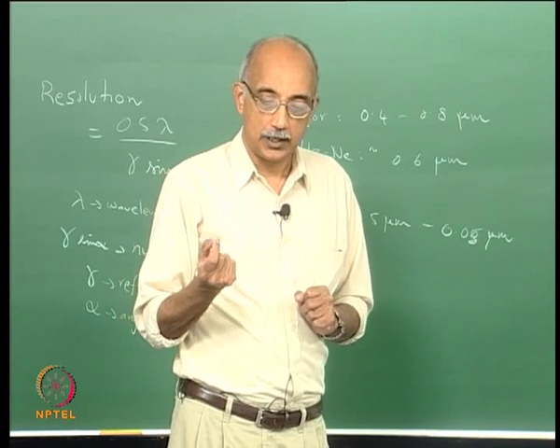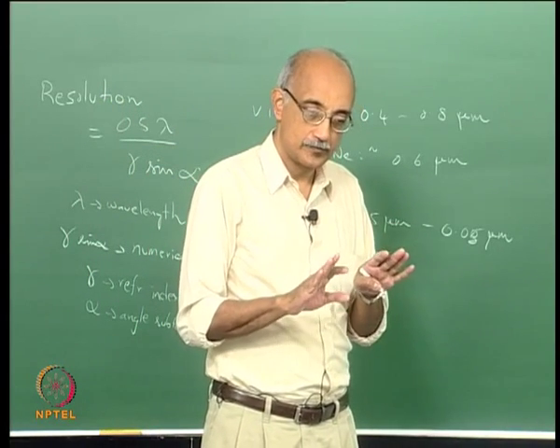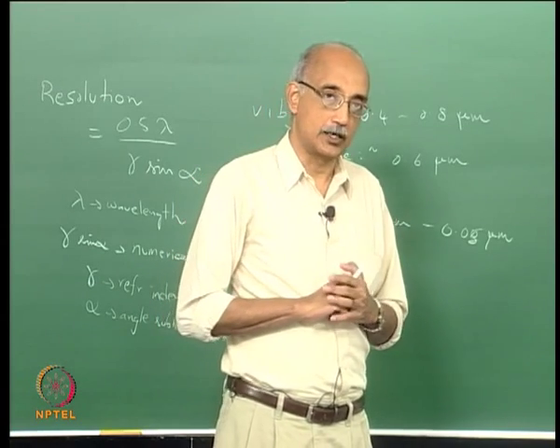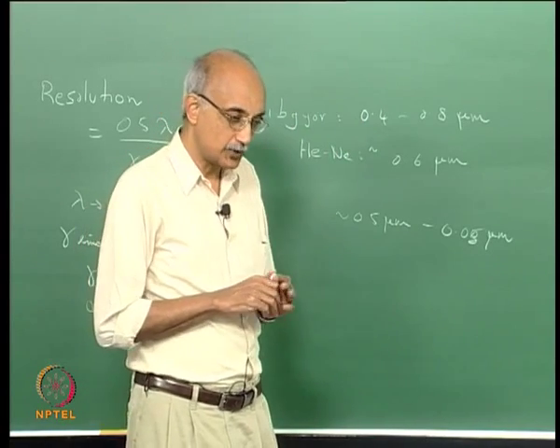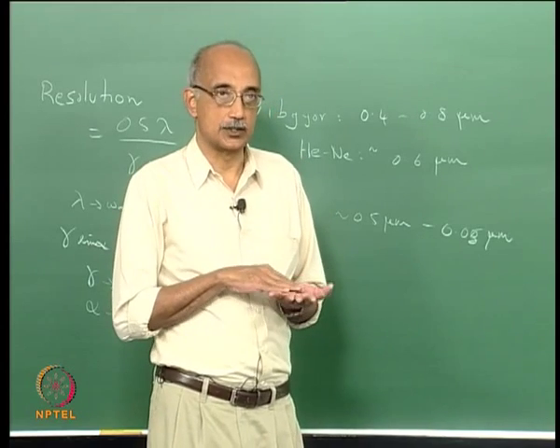Now, that technique works well for the most part if there is a clear delineation between a surface defect and a surface particle. Now, in many applications you may not care, but sometimes you do. You want to know whether something that you see on the surface is actually a feature of the surface or whether it's actually something sticking on the surface.